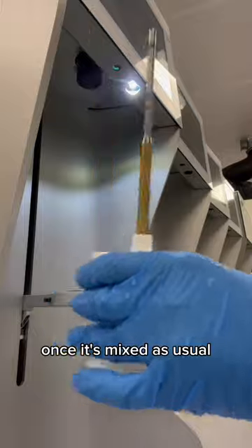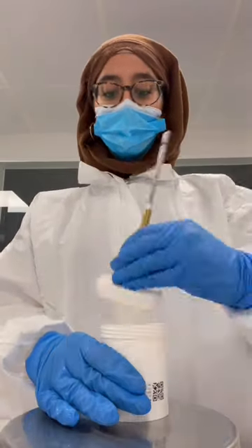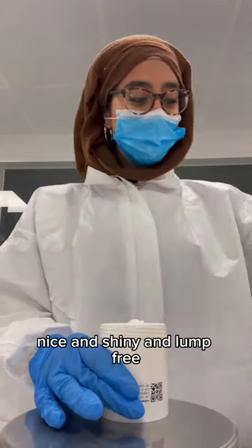Once it's mixed, as usual, let's have a look. Looks good to me — nice and shiny and lump-free.